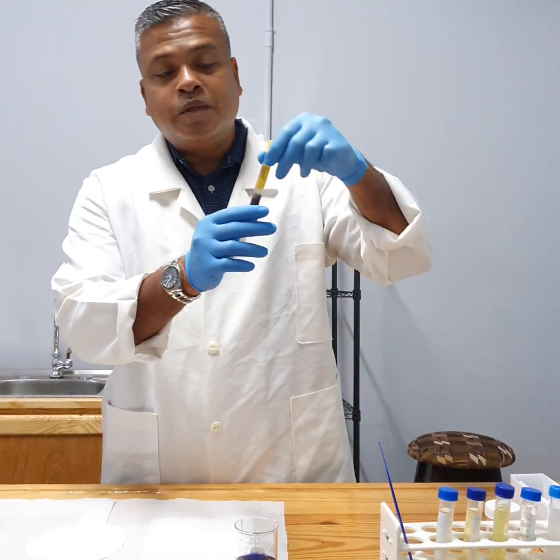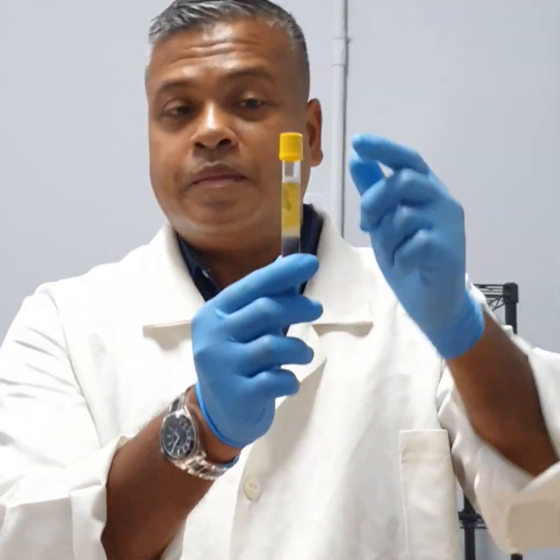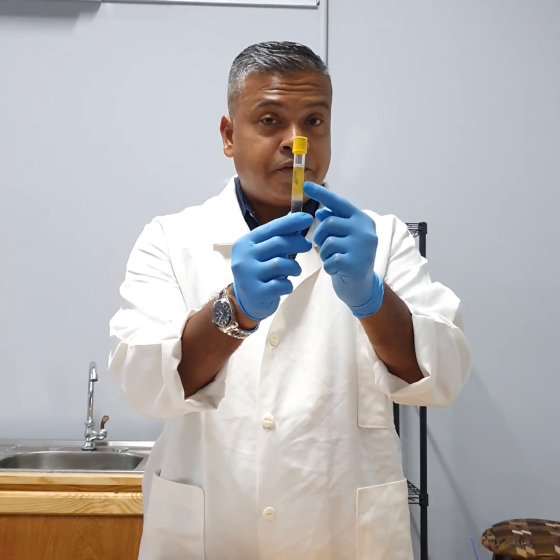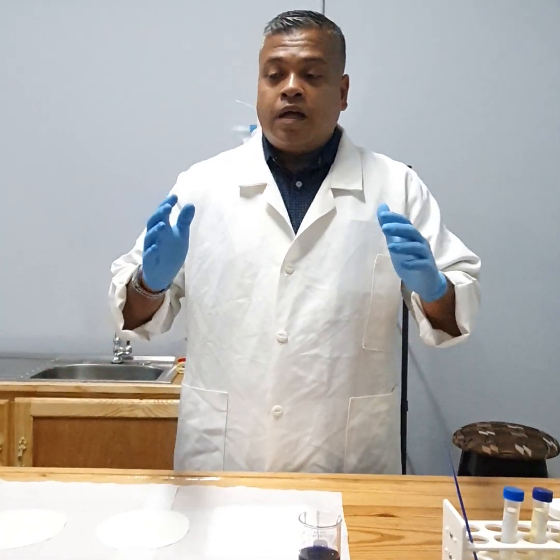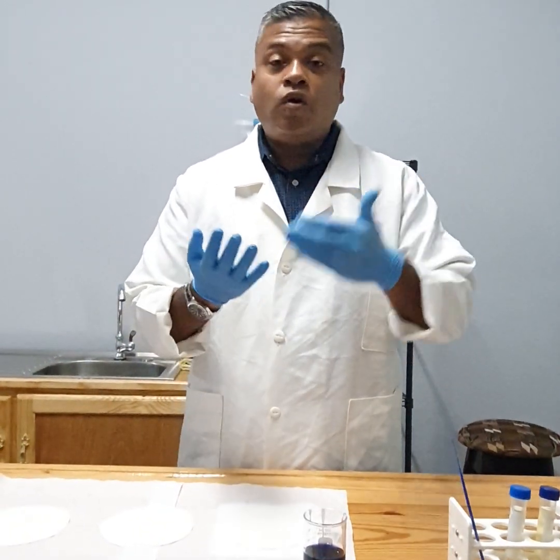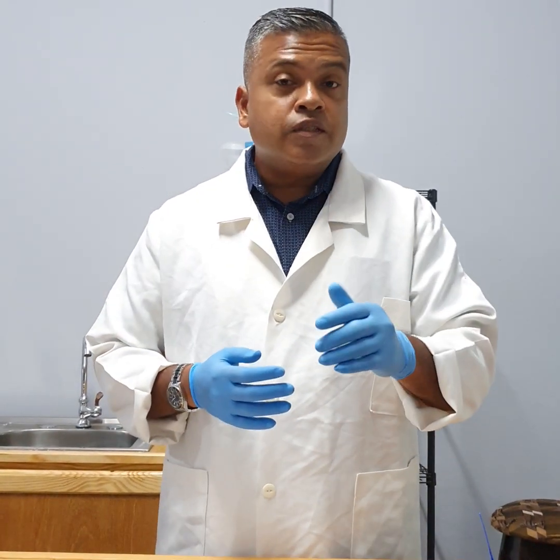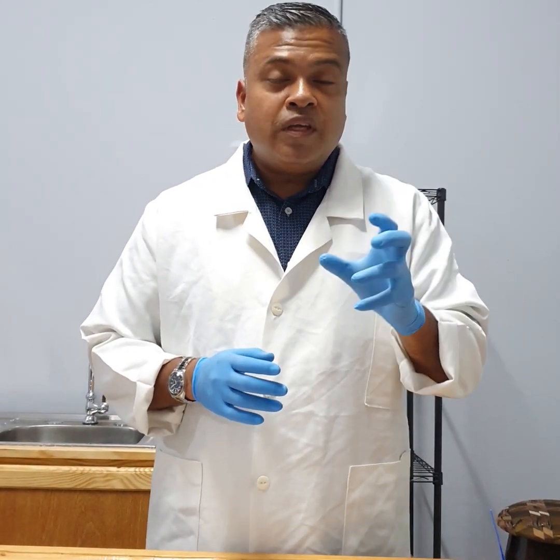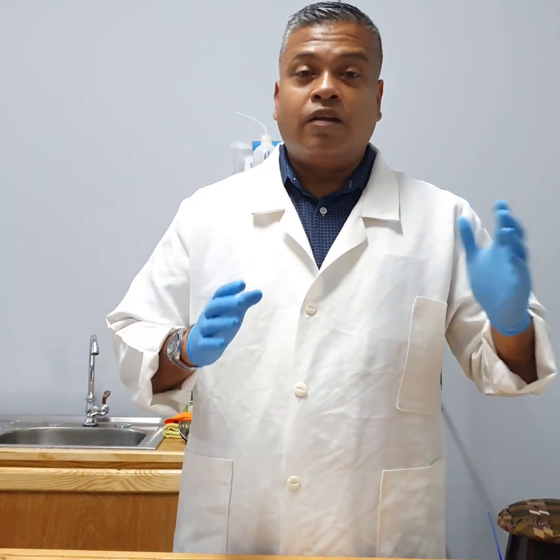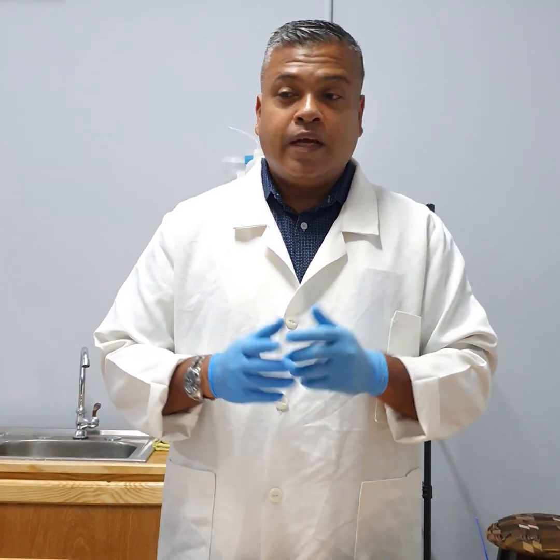What I've got here is a tube within which blood was clotted, and you've got your cells at the bottom, and this liquid here is called the serum. In this serum, you've got a beautiful assortment of things happening in there. You've got hormones, you've got electrolytes like sodium, potassium and chloride, you've got nutrients, you've got wastes, you've got other chemicals, substances, and that is the transport vehicle. That non-cellular component has a lot of stuff. That non-cellular component is what we use most of the time in laboratory tests to analyze a particular specimen.